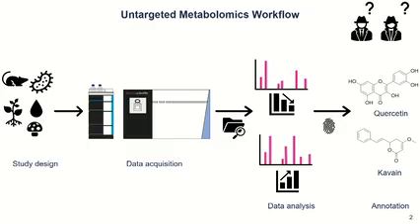So first of all, I want to go back one step to have everyone on the same page. What you did now was not the statistics, but if we think about a study design, we first have our samples, we acquire them, then we need to know which signals might be important, which signals we want to annotate in the end, and then we need to annotate them, and for this we need to have a fingerprint.